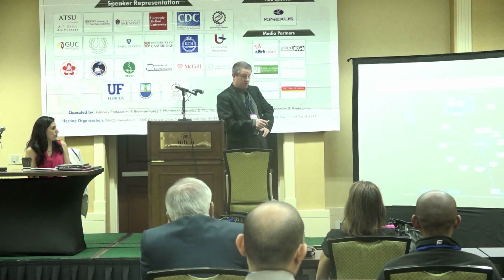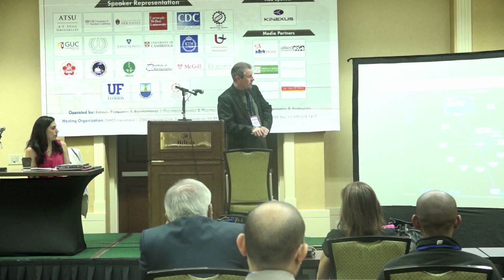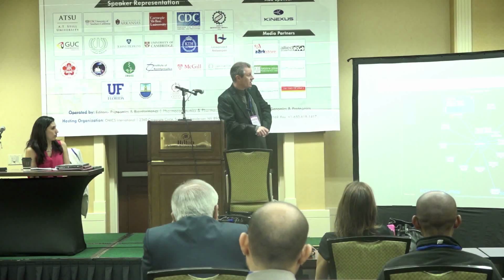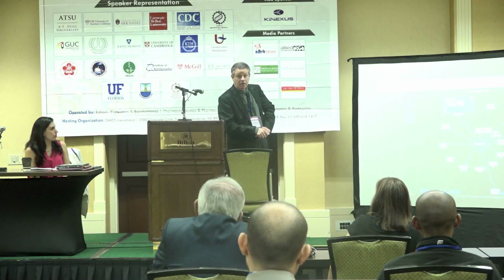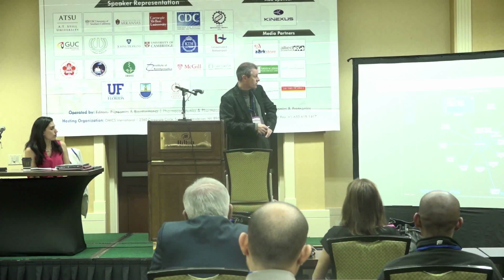And you can customize these maps online, so you can look just at predicted interactions, which will be dotted lines, or confirmed interactions, which are solid lines. So here is our target TrkA, the NGF receptor, and these are all the drugs that are known to interact with it. And the closer it is, the stronger the interaction is known to be. You can follow this and see that a lot of the predicted interactions are matching our confirmed experimental interactions, showing you the power of this algorithm for prediction of drug interactions.